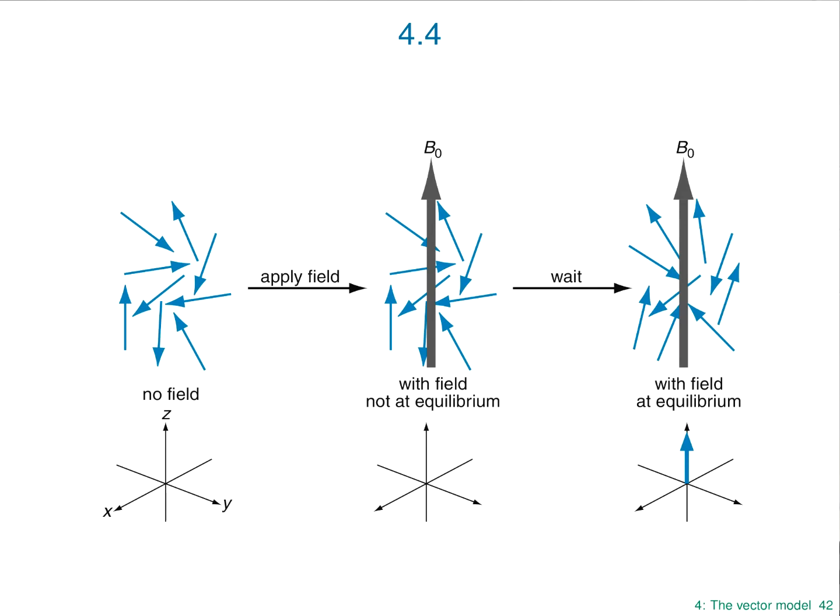Because the energy of interaction of the spins with the magnetic field is so small, this alignment is very, very tiny, and that's why I've drawn it as if they're still randomly aligned. You shouldn't think that all the spins suddenly go like this when you put them in the magnetic field.